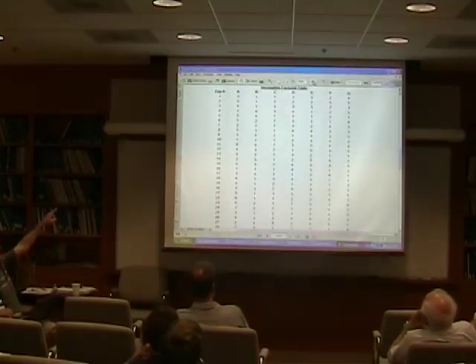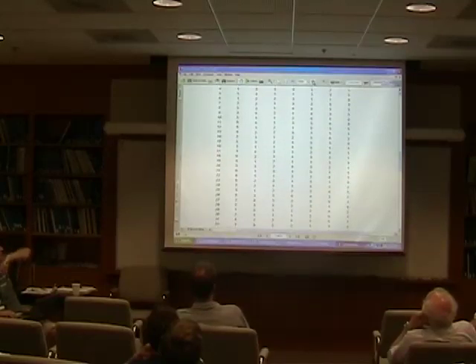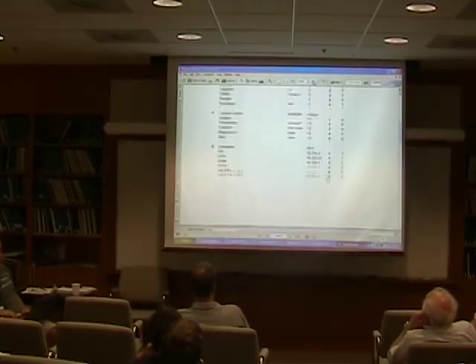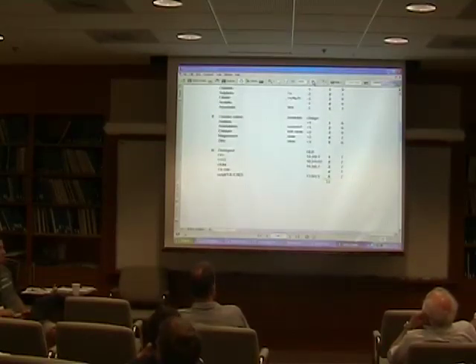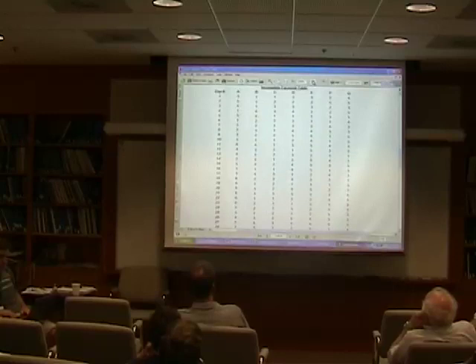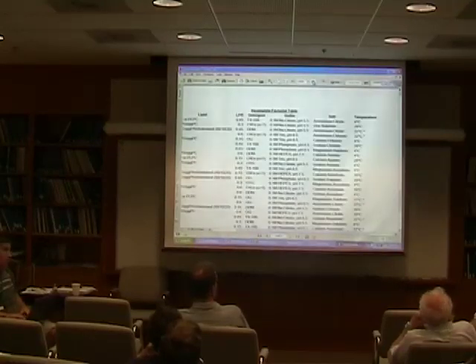So we've got properties A, B, C, D, E, F, and G across the top, and 35 experiments. So as Ben also mentioned today, you need to have at least one experiment more than the total number of parameters you tested. We've got a total of 33 here, so 35 should test that statistically well. Assuming they're independent. If they are not, then this doesn't hold. Okay. Yeah, true.